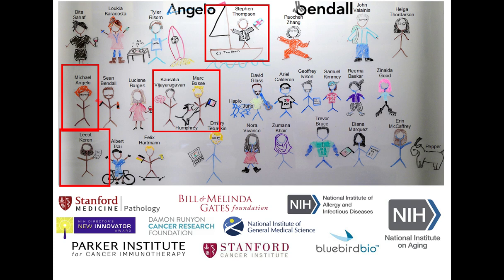The other type of overlap we do is how most of the images were generated here, which is we specifically build in an overlap of a few microns on the right and lower edge of each tile, and then we have a little algorithm that overlaps and aligns those things back together based on high abundant markers so we can stitch those multi-tile images. And then we use some pretty standard noise removal approaches to take the extra signal out of the overlap part, which, again, is nothing that we invented. This is really borrowing from the toolbox that people who do regular light-based microscopy have been using for years.